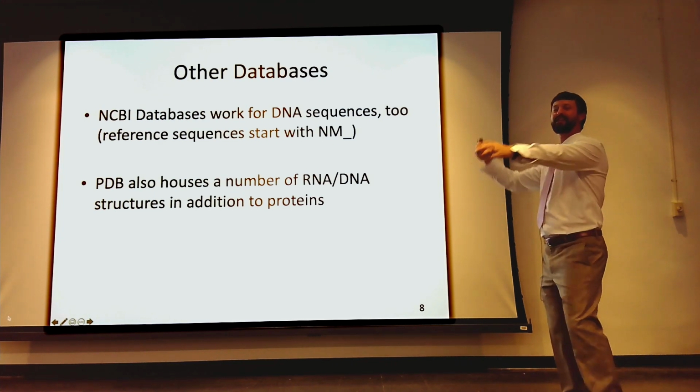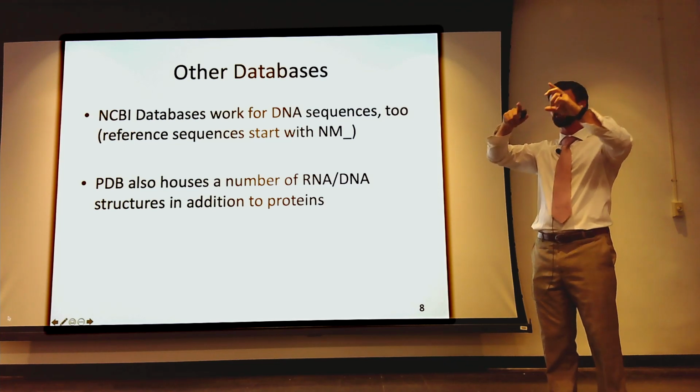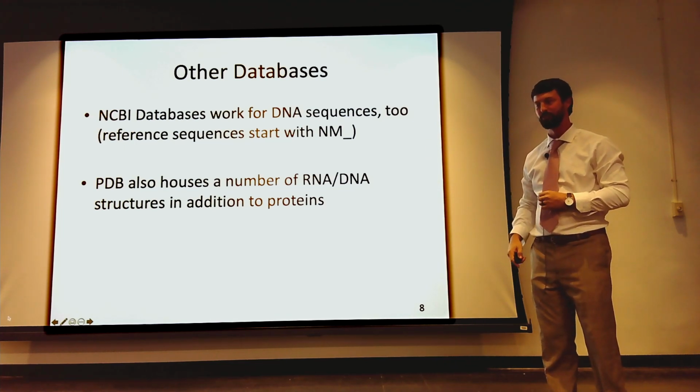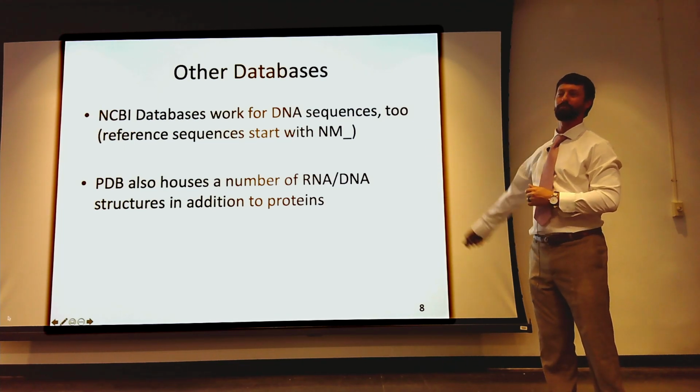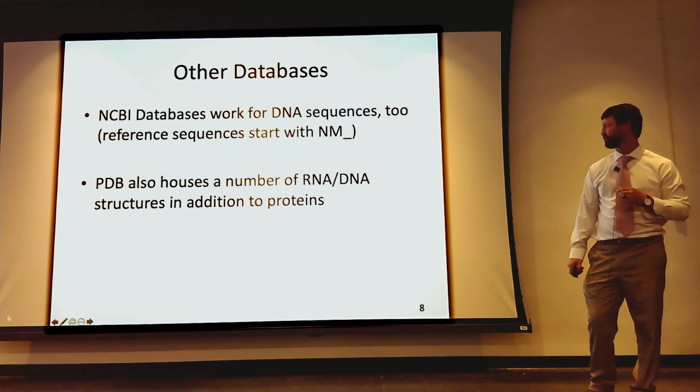Don't sit there and try and calculate everything by hand. I've had people take the little table and try and translate everything on their own, do reverse complements. We already have tools. Use them, play with them. They're faster, right? Use them to double check yourself. It's a good deal.